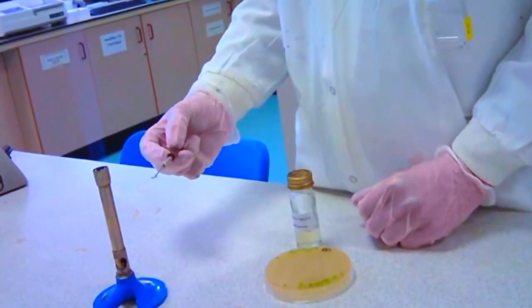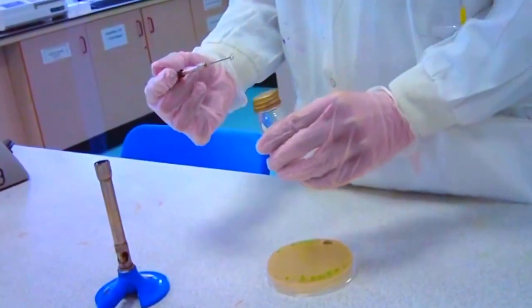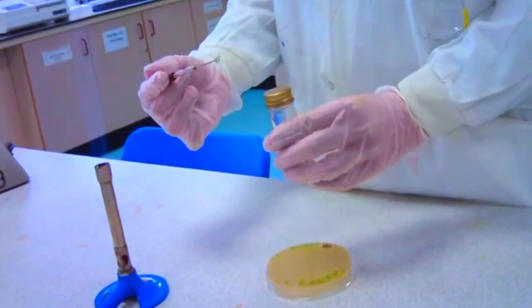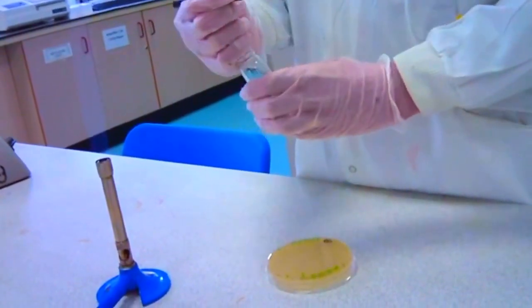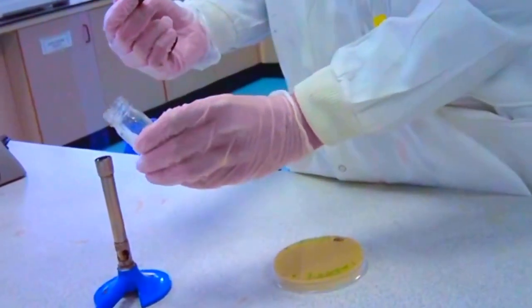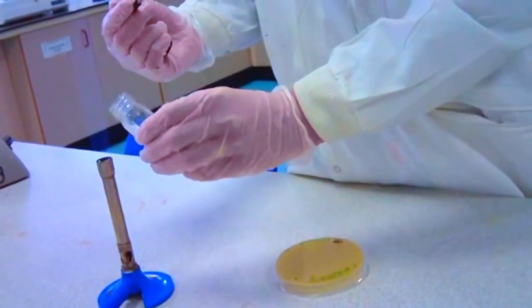Without putting the loop down, lift the test tube containing the inoculum with your left hand. Remove the cap of the bottle with the little finger of your right hand. Pass the neck of the bottle through the flame 3 or 4 times so it becomes sterile.